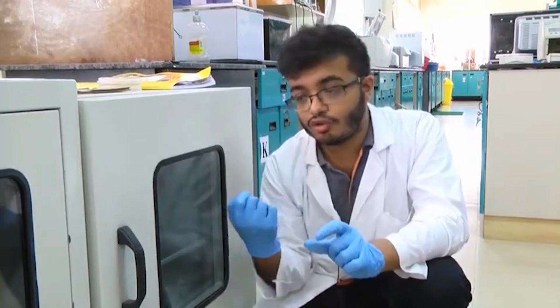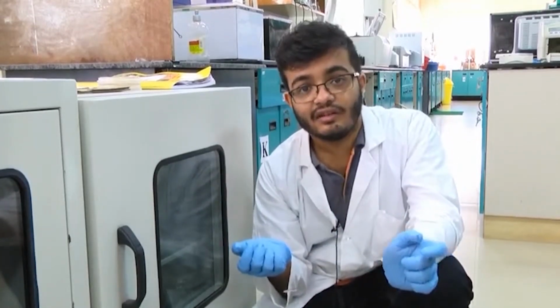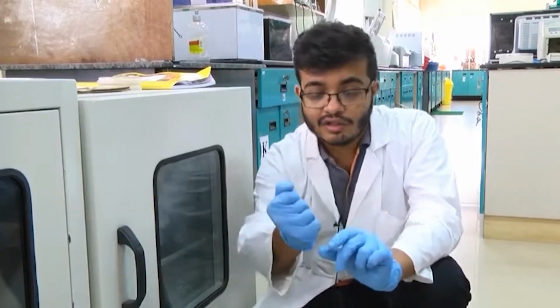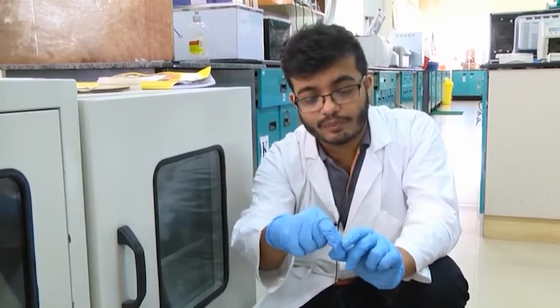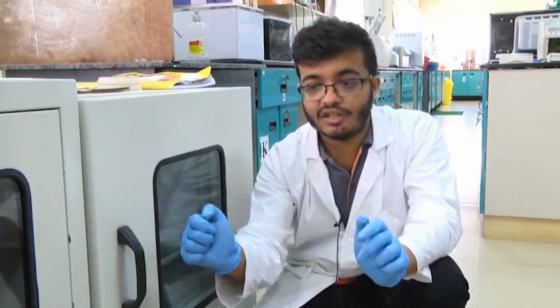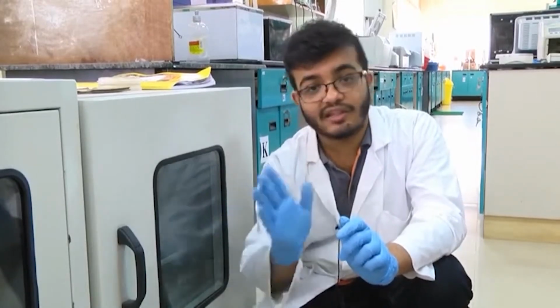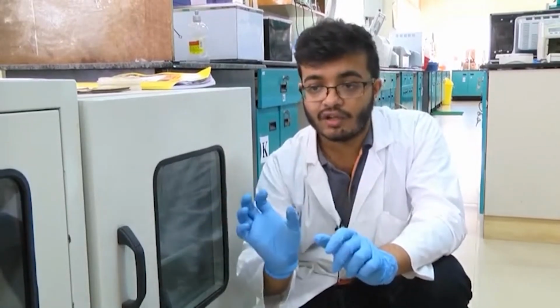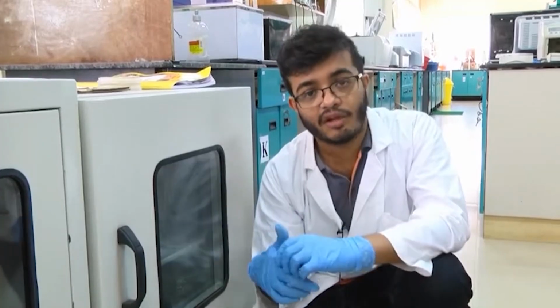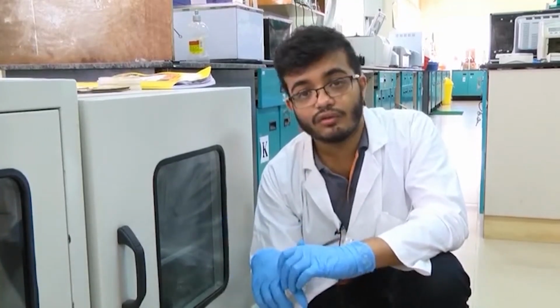So, each time you need to grow more of the culture, you go to the minus 80 degree centigrade fridge, take that vial out, immediately scrape off a small speck, it will be frozen solid, just take a small speck, drop it into media containing antibiotic and leave it overnight, bacteria will grow from there. So, what you should be doing is making a cell stock, and with the remaining 4.5 to 5.5 ml of culture that you have from the overnight growth of the colony, you should isolate plasmid.